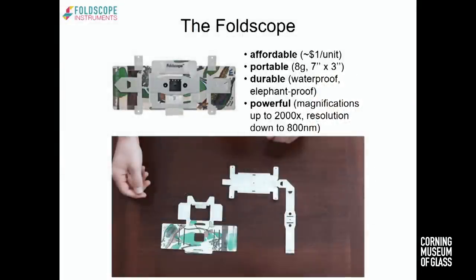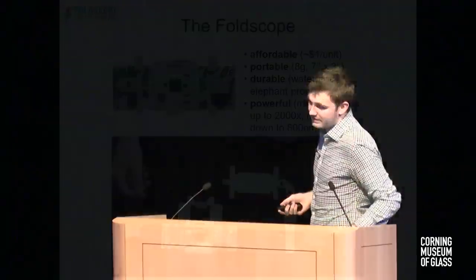I think a lot of people, when you tell them that you work on an origami microscope, imagine that it looks like this, but folded out of paper, like a paper crane, into a three-dimensional box-like thing that is a microscope. What it actually looks like is this. Those of you who saw the demo booth earlier have seen this in person, and I'll be showing some after my talk today as well. It's this 3x7-inch tool with almost no thickness to it, just a few millimeters thick, really. We'll go into the design principles that led us to this point.